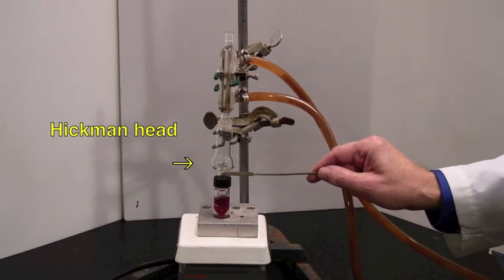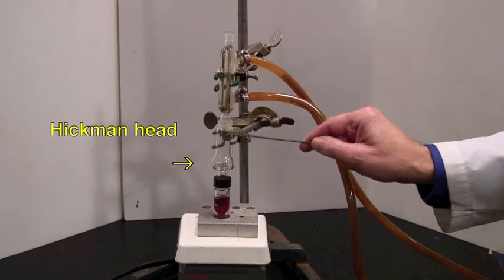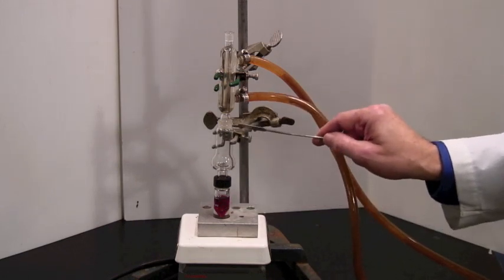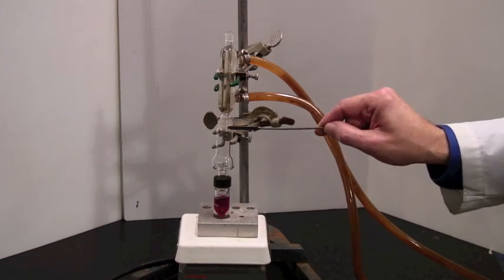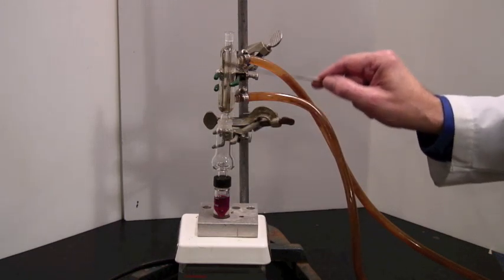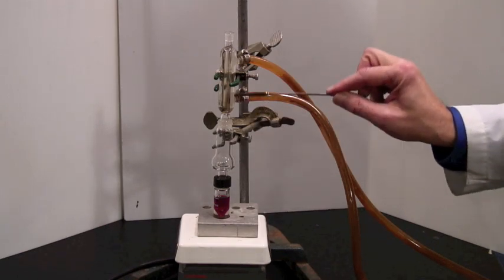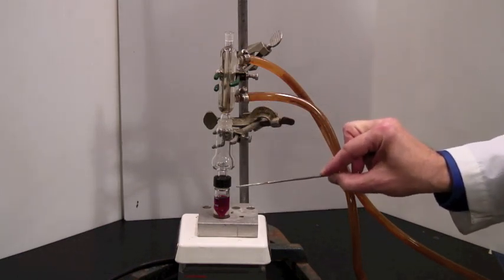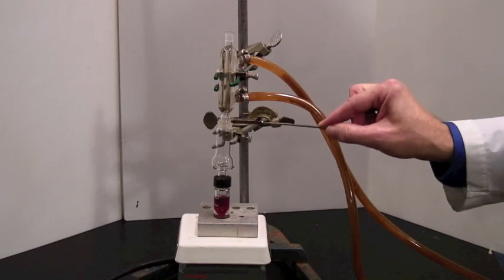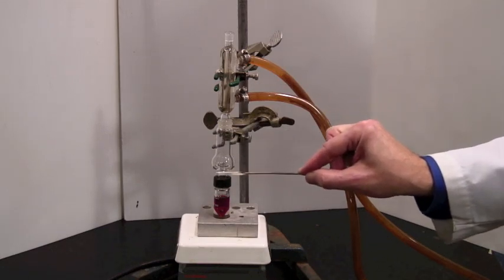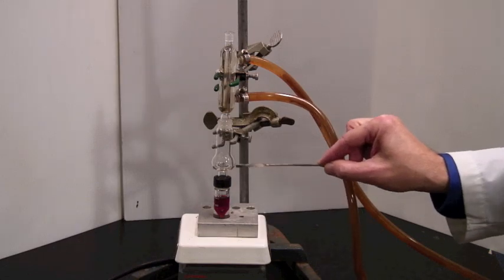This piece of glassware you've not seen before. It's called a Hickman head, and this is where the distillate will collect. Notice that the Hickman head and the vial are clamped to a stand. In the top of the Hickman head is a standard water condenser. You've seen one of these before. Back at the Hickman head, when vapor moves up, it will condense and trickle down, and it will collect in this circular well around the outside.